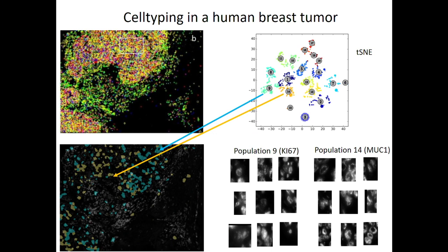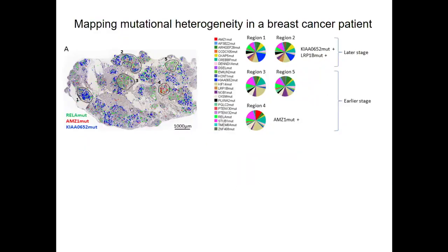They look messy, as tumor cells of tumor nuclei often do. But the interesting thing is the population 14 looks even messier. They have huge vacuoles in the nucleus. So we found we can use these molecular data to find a morphologically distinct subpopulation of cancer cells. So that's reassuring that we're actually finding something biologically relevant.